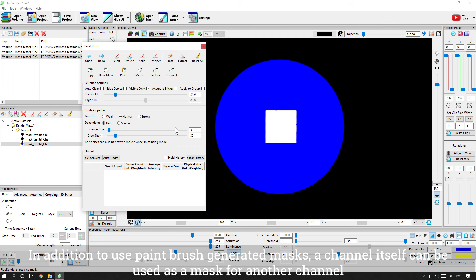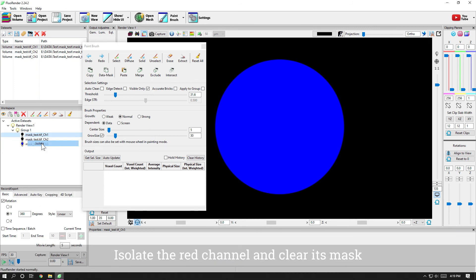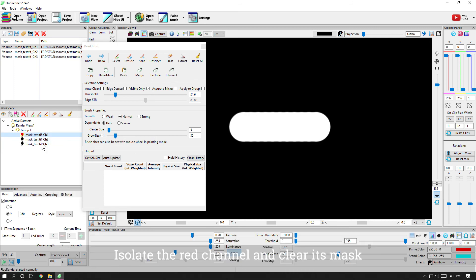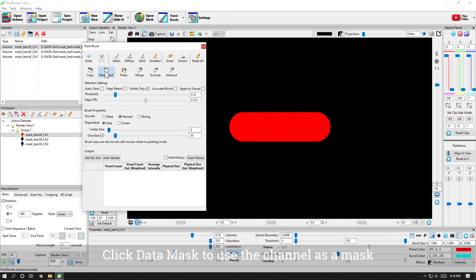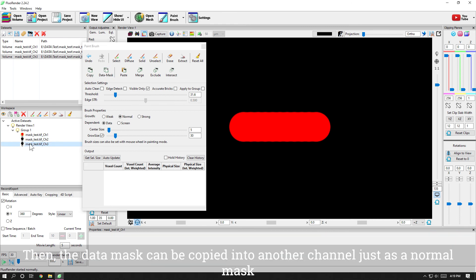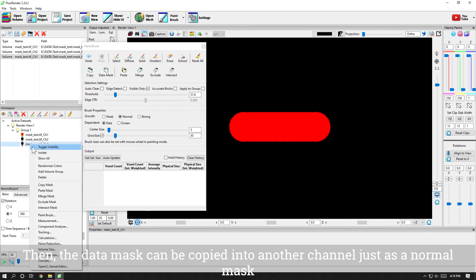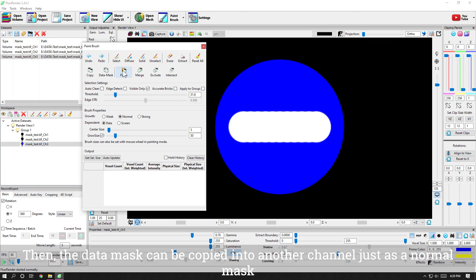In addition to using paintbrush generated masks, a channel itself can be used as a mask for another channel. Isolate the red channel and clear its mask. Click data mask to use the channel as a mask. Then, the data mask can be copied into another channel just as a normal mask.